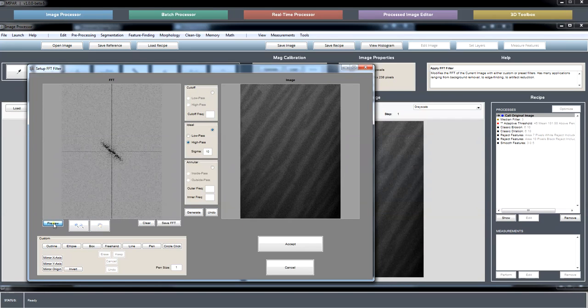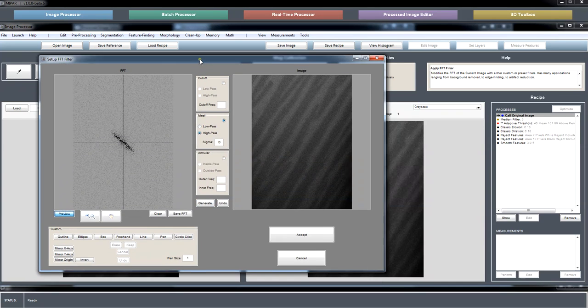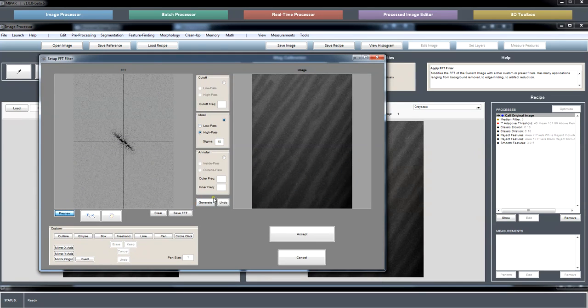A high-pass filter is in fact identical to a Gaussian blur and subtract operation. By blurring the image, you're keeping the lower frequencies and then subtracting them away, leaving the higher frequencies. It's usually easier to understand that than understanding a high-pass filter.